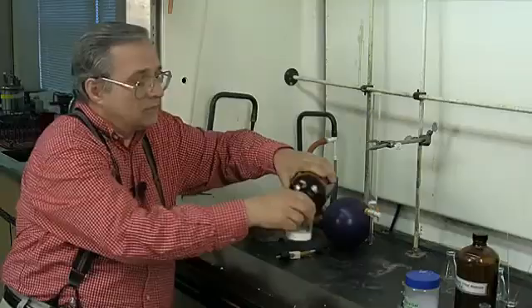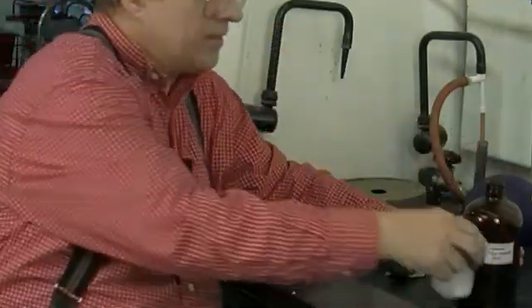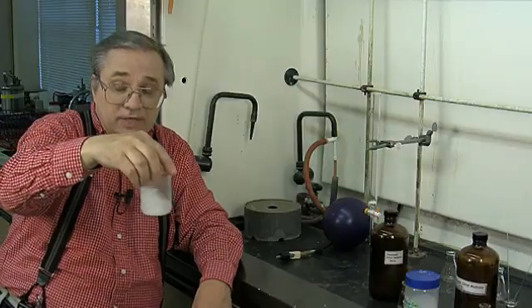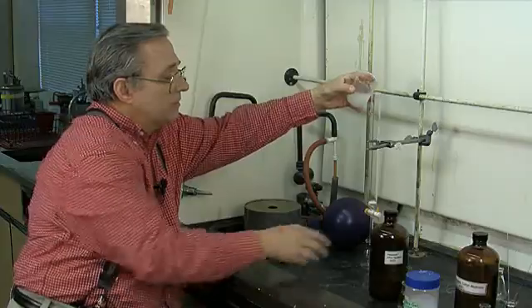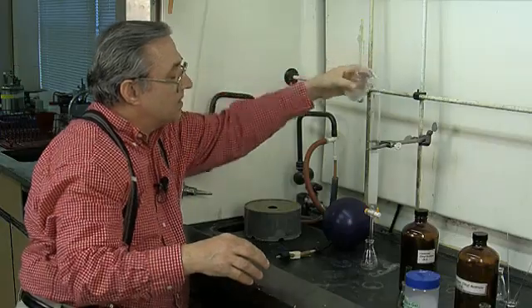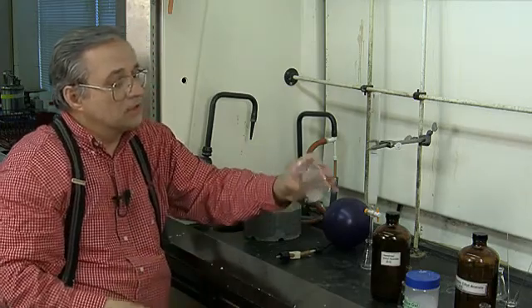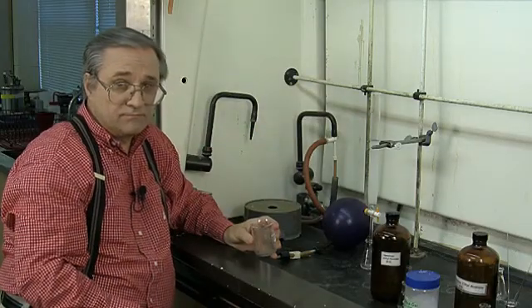I'm going to pour in the 8-to-2 hexane/ethyl acetate and swirl it around to make a slurry — I want to suspend the silica gel in the solvent. Then I pour it down into the column with the burette stopcock open. If you have any silica left over, simply use more hexane/ethyl acetate, swirl to suspend it, and before it has a chance to settle, pour it down.